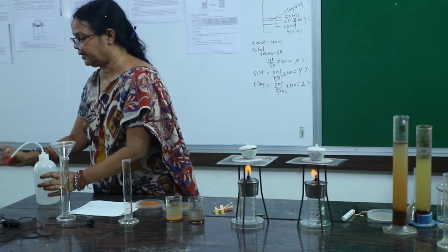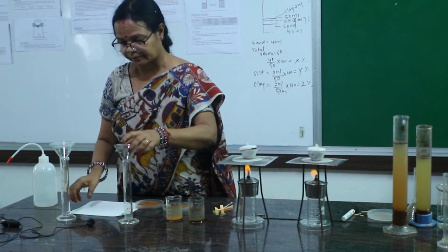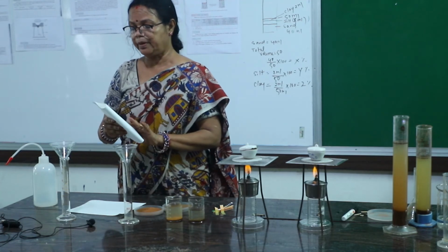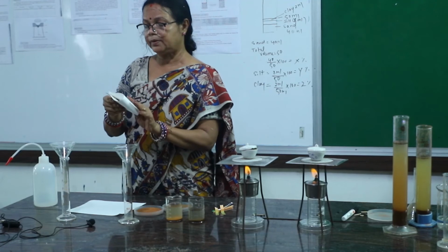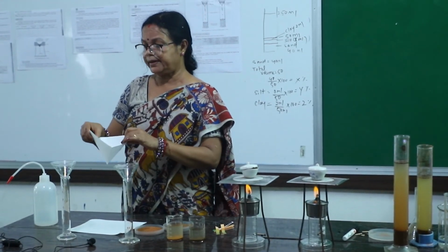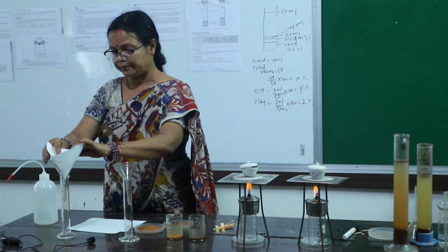Filter paper, fold it like this. First fold, second fold, then one side 3 layers, other side 1 layer. In this way you have to fix it here in the funnel.